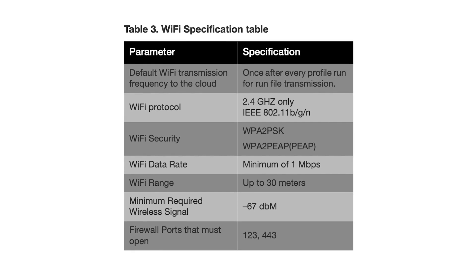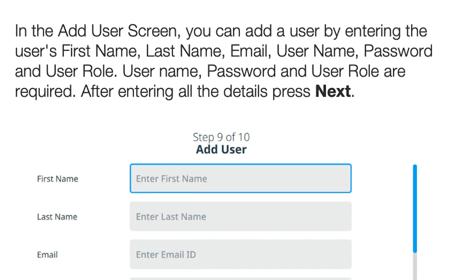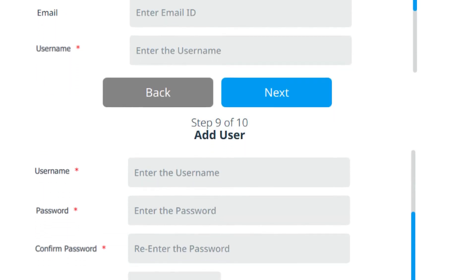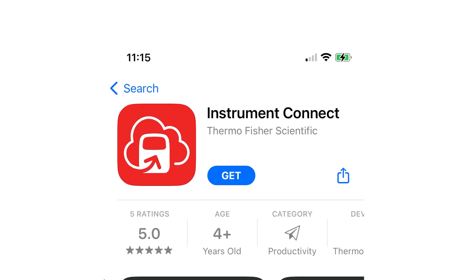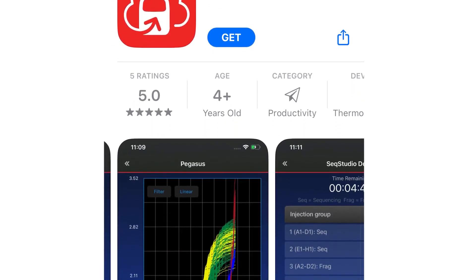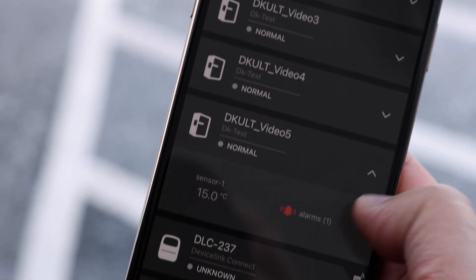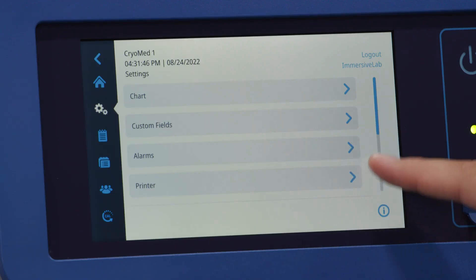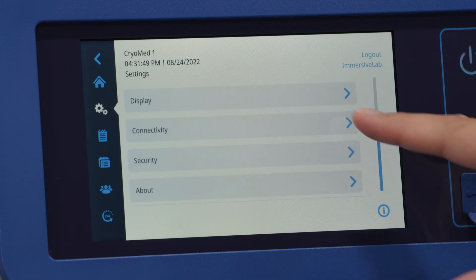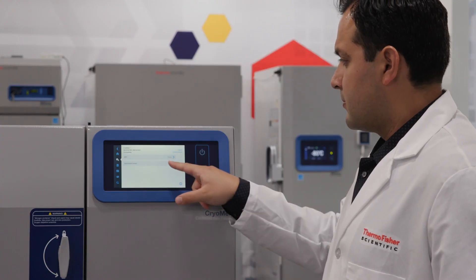First, confirm that your network security parameters are acceptable for the Wi-Fi specifications in Table 3 of the manual. Second, follow the instructions to create a Thermo Fisher Connect account, to then link the unit, along with others, into Instrument Connect. As an additional option, you can download the Instrument Connect mobile or tablet applications from the App Store or Play Store. Now return to the Cryomed UI, and use the Settings icon on the left-side menu to navigate to the Connectivity screen. Set up your wireless network and connect Instrument Connect.